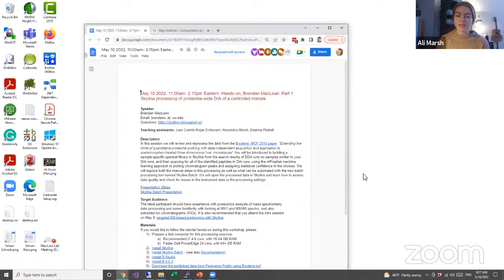However, if you do plan to do that, some other R packages are required. So just take a look at those questions that have been answered in the Q&A, and I point you to where to install MSstats and all of the other R packages. I studied what Ali presented last year, and I'm going to open up RStudio and do some of the same steps that she did last year to show you how I installed MSstats, and I did get through it successfully.